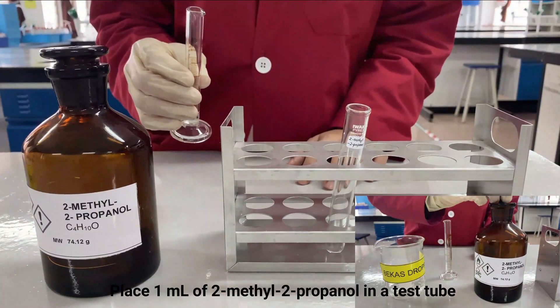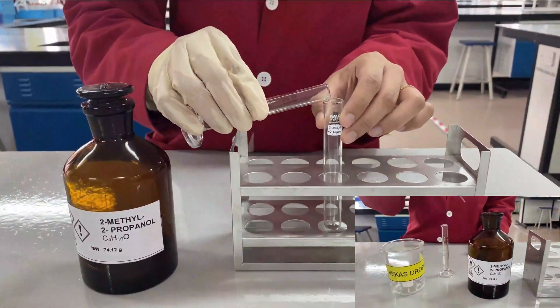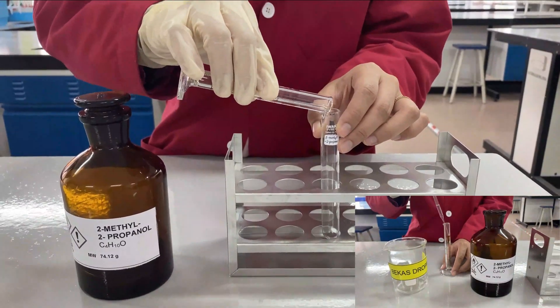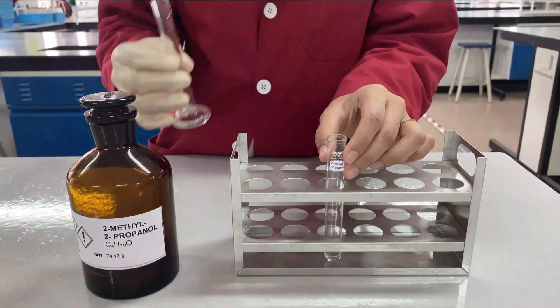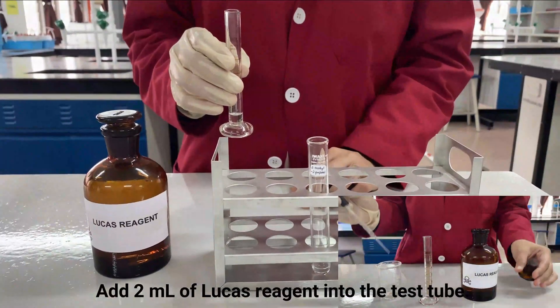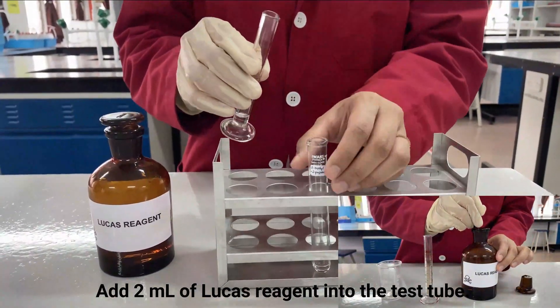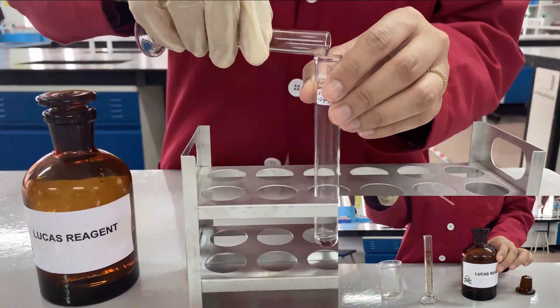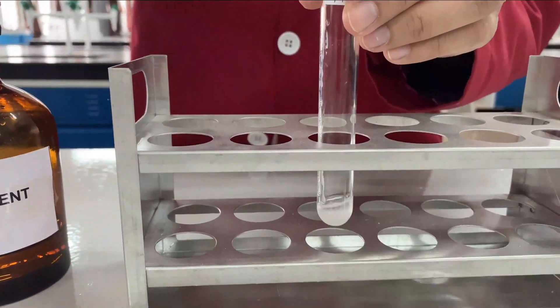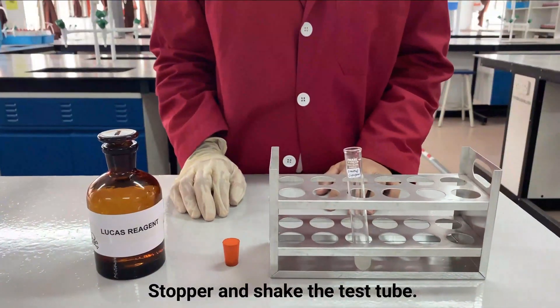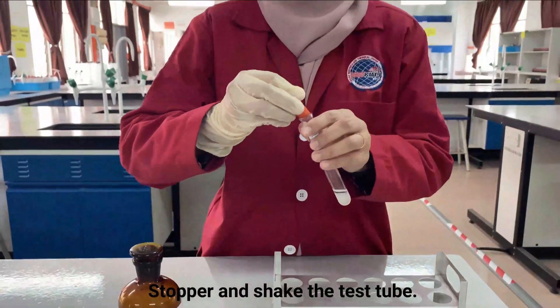The first step is to place 1 ml of 2-methyl-2-propanol into the test tube. The second step is to add 2 ml of Lucas reagent into the test tube. The third step is to stopper and shake the test tube.